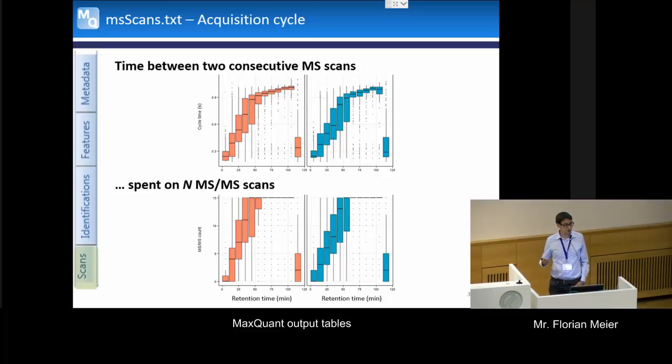So it's also interesting if you set this n parameter to 100, for instance. Actually, through the threshold filtering, you're never going to reach the 100. So it's a nice experiment just to set it to 100 and see what is actually the maximum number of precursors that you could find in your MS scan.